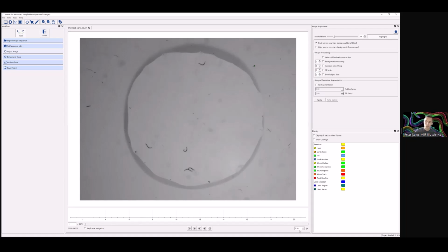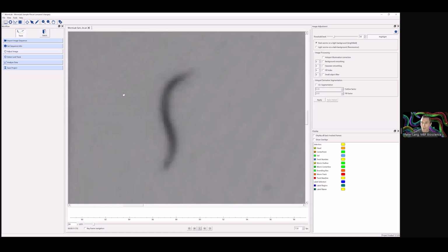We want that just so that we have sufficient temporal resolution, because as you see, I'll play this video. These worms definitely are going to move much more quickly compared to the crawling worms. When you think about what's going on with our tracking algorithm, I'll zoom in here so you can see, we're looking, on a frame-by-frame basis, at the change in the midpoint position of the worm.